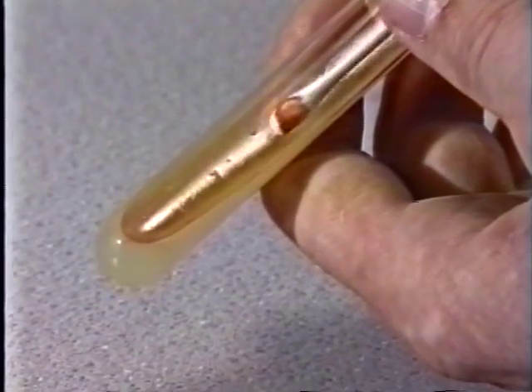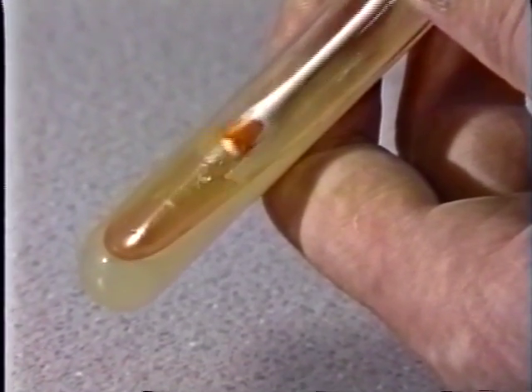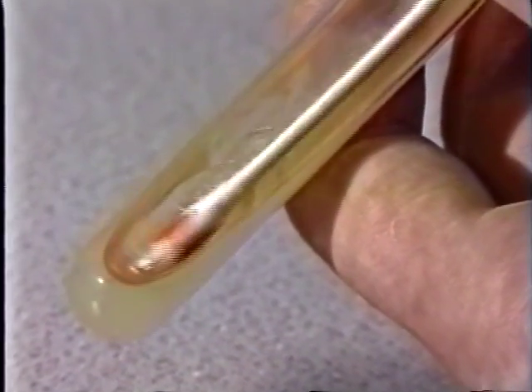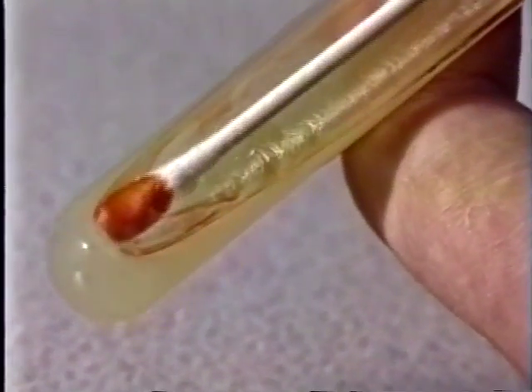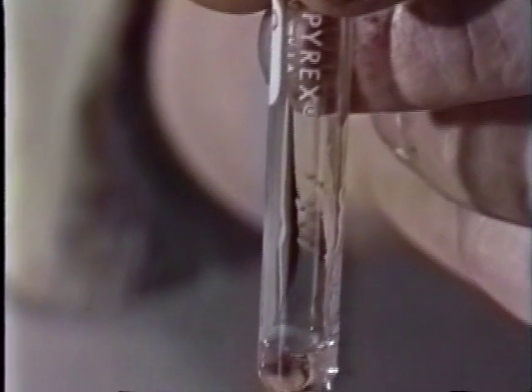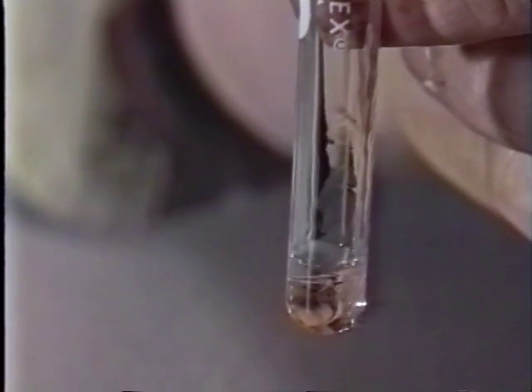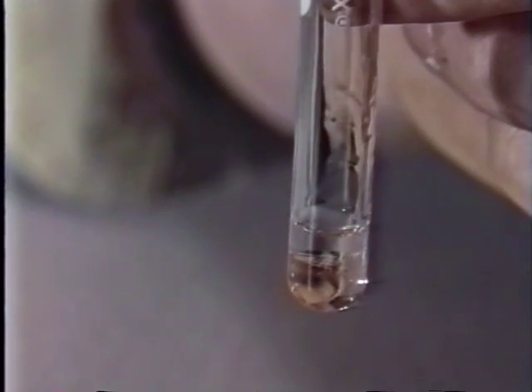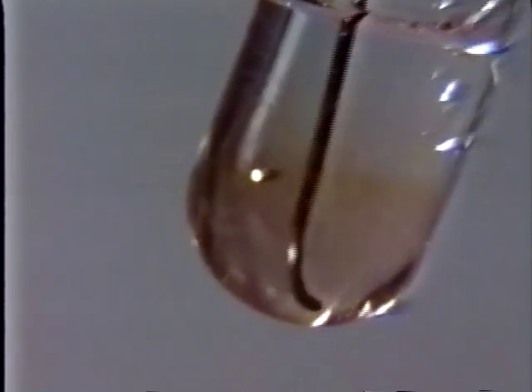Bacteria, ideal organisms for investigating the molecules of life. This viscous material is made up of one of life's most famous molecules.